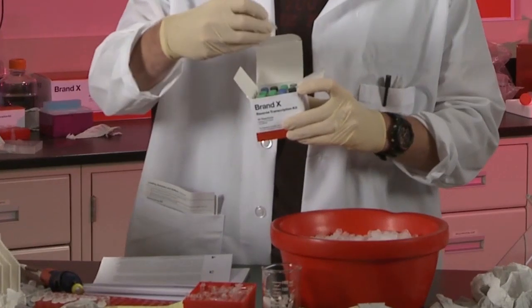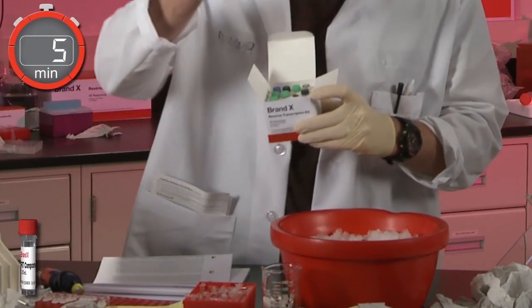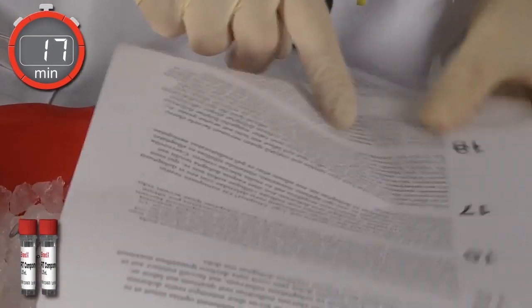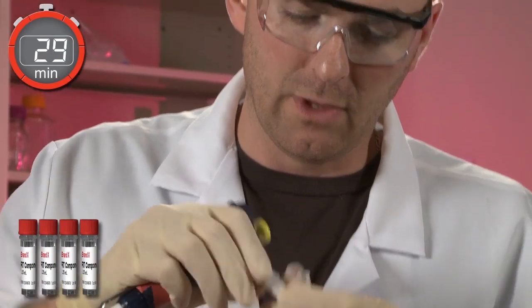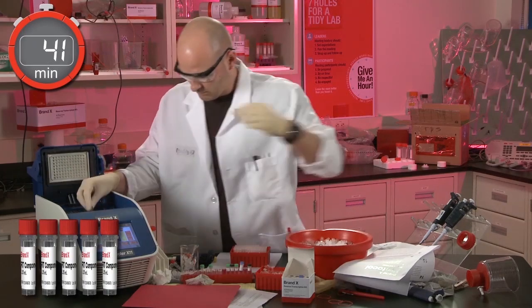On the right, Bob will be using a leading brand's reverse transcription kit. First, Bob will need to unpack and prepare all of his supplies, putting some reagents on ice, others at room temperature, and then programming his thermal cycler. And now the fun really begins! Welcome to the drudgery of traditional reverse transcription. Bob will need to carefully pipette exact volumes of numerous reagents and heat and cool tubes to precise temperatures at various stages.